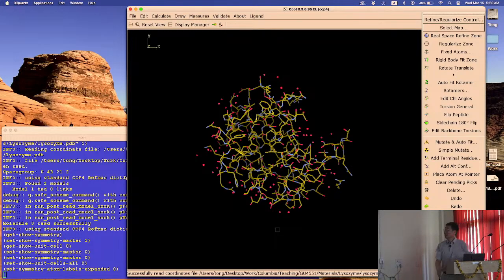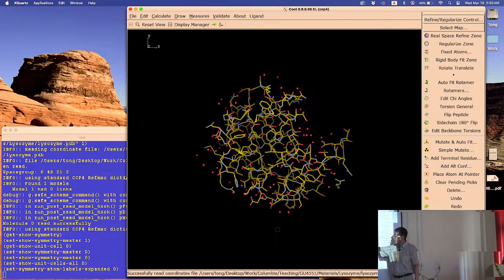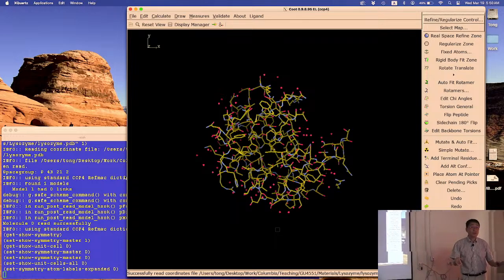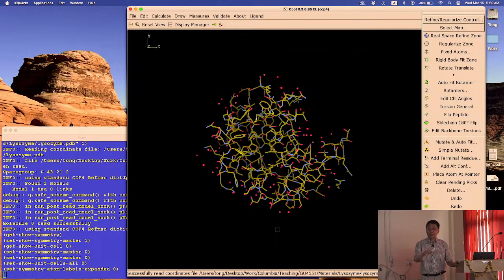Okay, now let's play with colors. Let's change the color of these things. Okay, are you paying attention to me? If you're not with me, please speak up so we'll wait for you. I don't want you to fall behind.